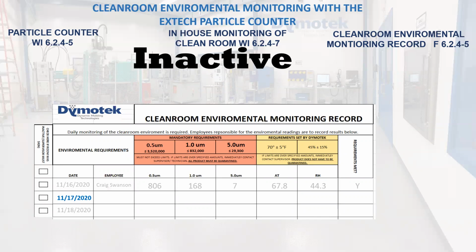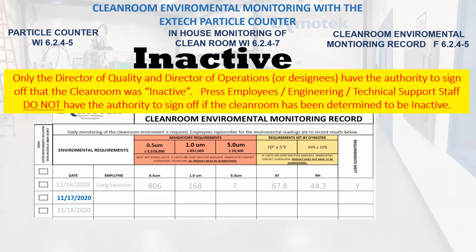If the room is inactive for an entire day, then the room may be checked off as inactive and a particle count is not required. Only the Director of Quality and the Director of Operations or their designees have the authority to sign off that the clean room was inactive.